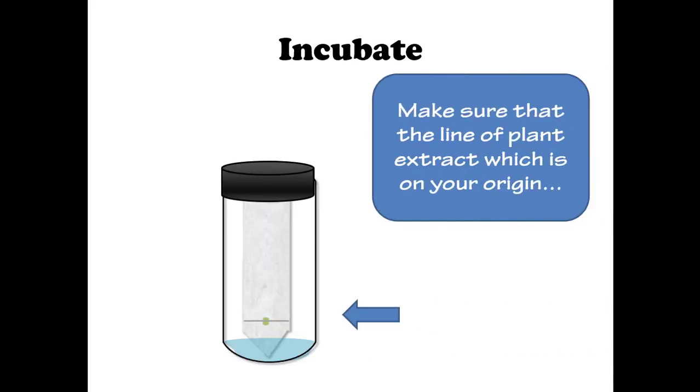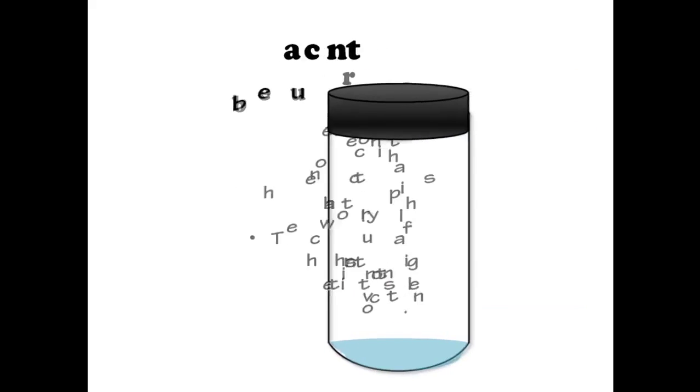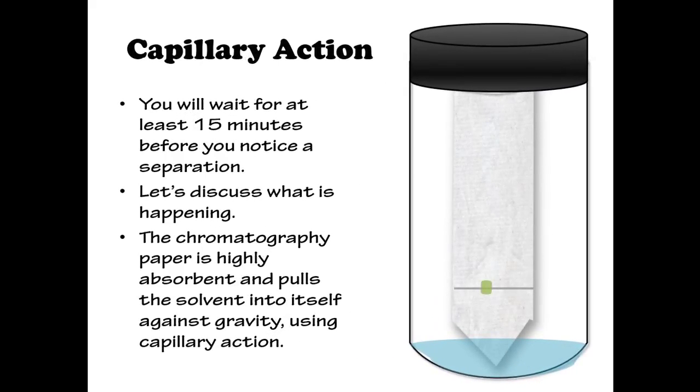Make sure that the line of plant extract, which is on your origin, is not in contact with the solvent. You will wait for about 15 minutes before you will notice any separation. Let's discuss what is happening.